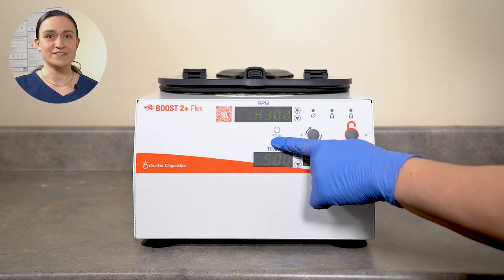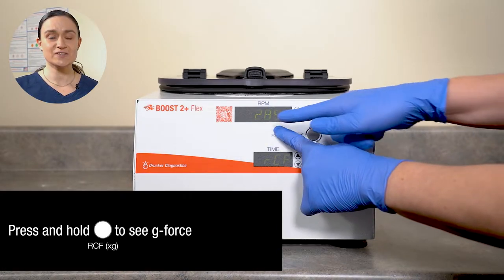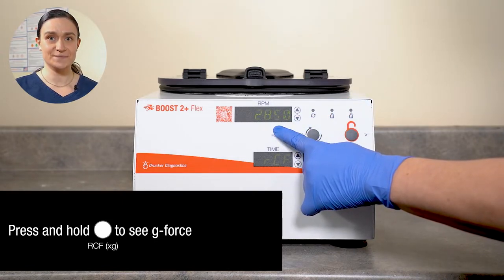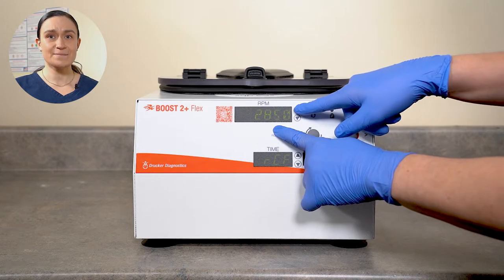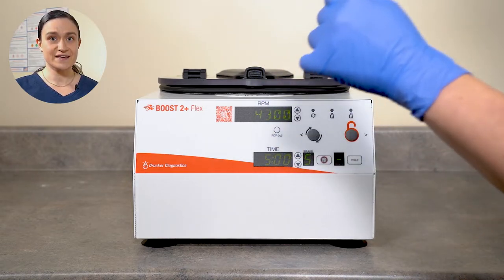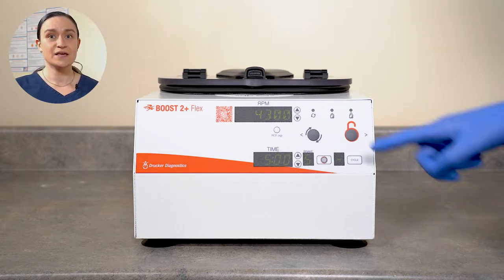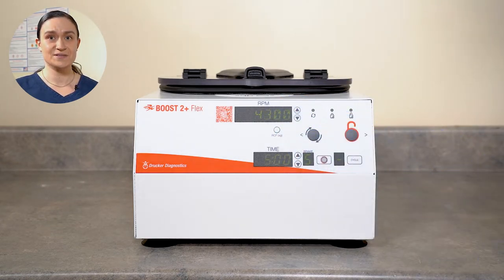Underneath the RPM screen, we have the RCF XG button. Pressing and holding this button will change the number on the RPM screen to instead represent the RCF or XG. When you have the RCF XG button held down, you can use those same buttons to the right of the RPM screen to adjust your speed using G-force instead. Once you release the RCF XG button, the RPM screen will revert back to showing RPMs. If you adjust RPMs, you are inherently adjusting the G-force, and if you adjust your G-force, the RPMs will adjust as well.